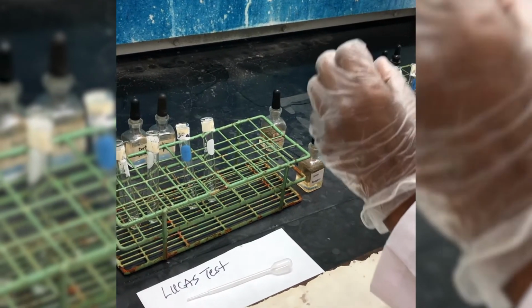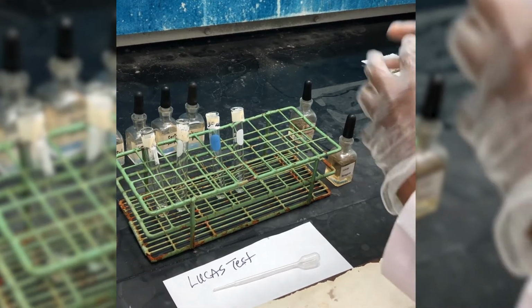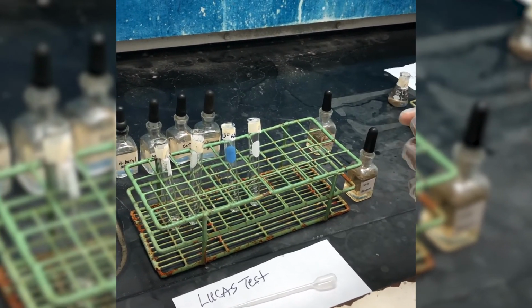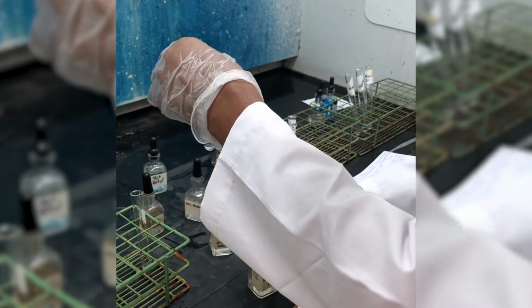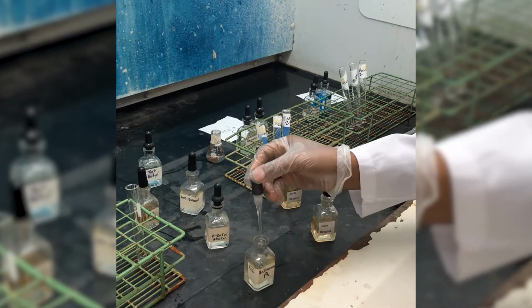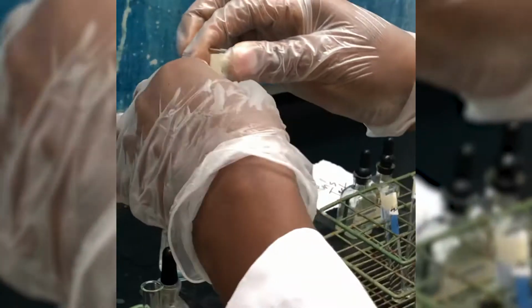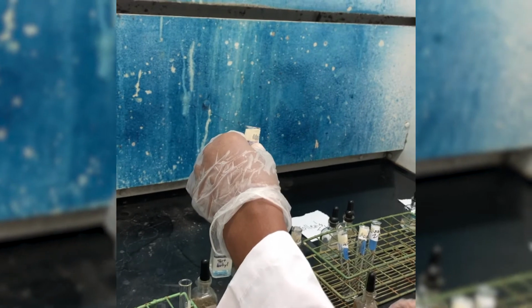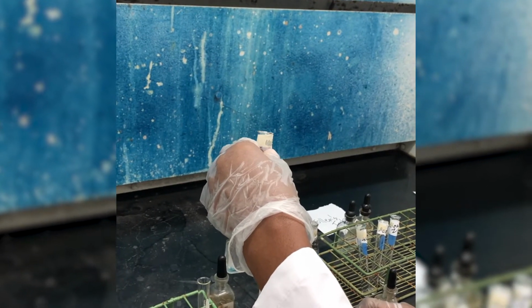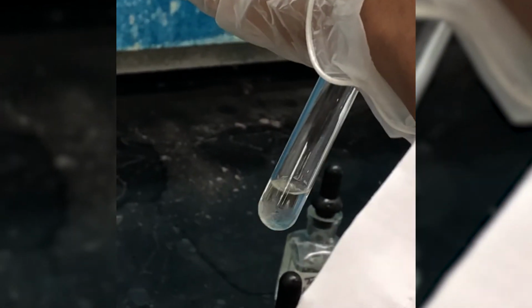So we have an unknown A, which of course is an alcohol. But we want to determine whether our unknown is a primary alcohol, a secondary alcohol, or a tertiary alcohol. So I'm going to put some amount of our unknown A in the test tube. So this is just unknown A. Now the next thing is I'm going to add the Lucas reagent to help us determine whether we have a primary, secondary, or tertiary alcohol.